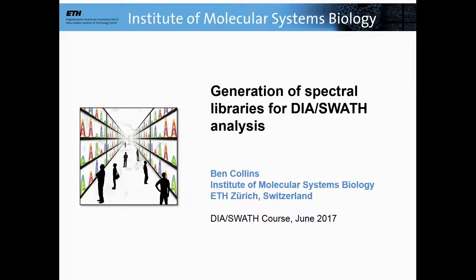So the goal here is to bring you up to speed on how to generate these spectral libraries, at least the way that we do it. And this will also be the topic of the first tutorial that we're going to do directly after this. So pay attention, and then you can do well in the tutorial.